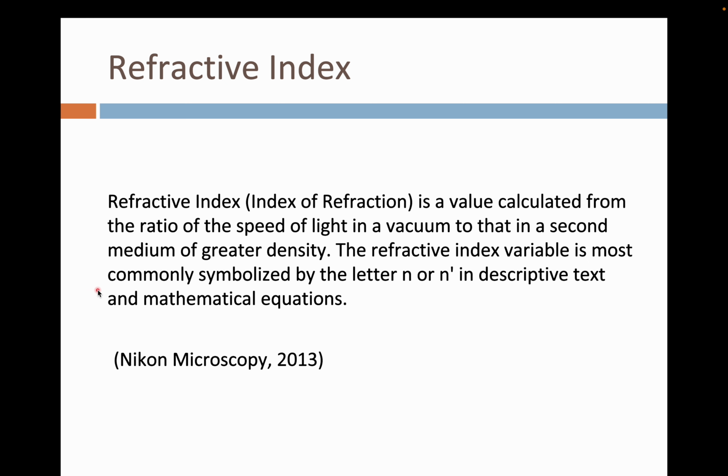So imagine light passing through two different mediums. First is a vacuum, and the second is a medium with higher density relative to the initial environment. So the refractive index is a variable that we use to optimize magnification.